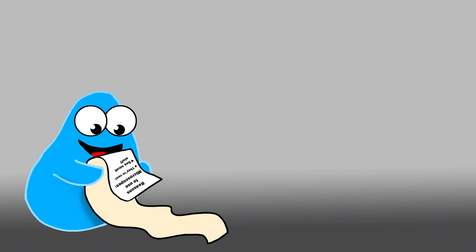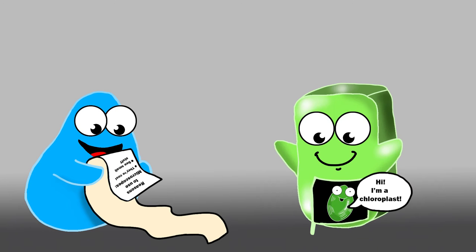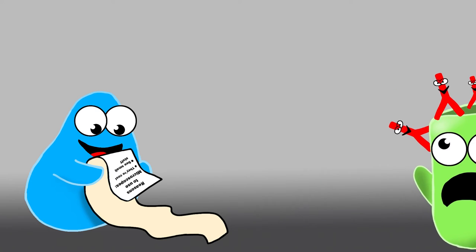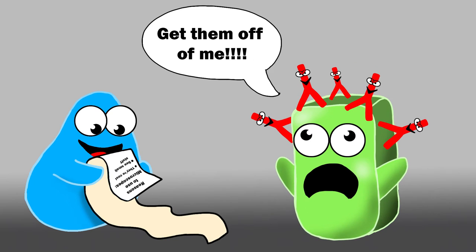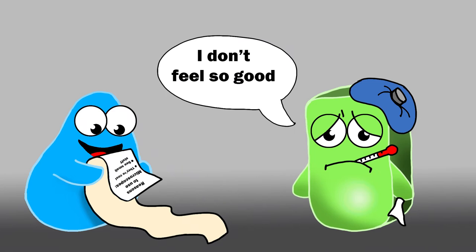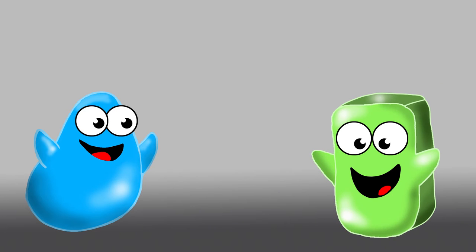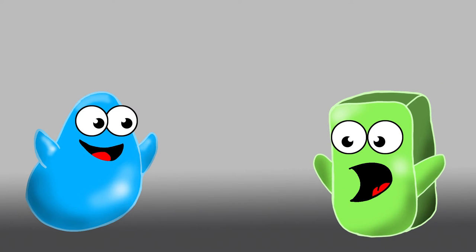There's so many reasons scientists use microscopes, like to look at the structure and size of cells and their organelles, see how cells move, figure out where proteins are located in cells and tissues, diagnose diseases, see what happens to cells and tissues when you alter genes, plus like a million others. Wow, microscopes can do a lot.